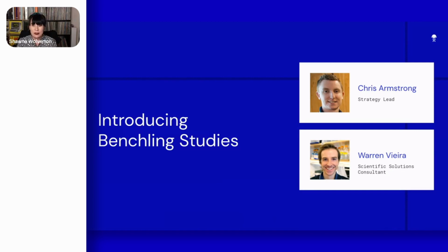But as we're developing more automation around all these handoffs and automating redundant tasks, there's a huge opportunity for us to connect parts of the organization that have been historically isolated. And it's my understanding that it's really what inspired Chris and the studies team to build a new solution to connect in vivo study management. What can you tell us about that, Chris?